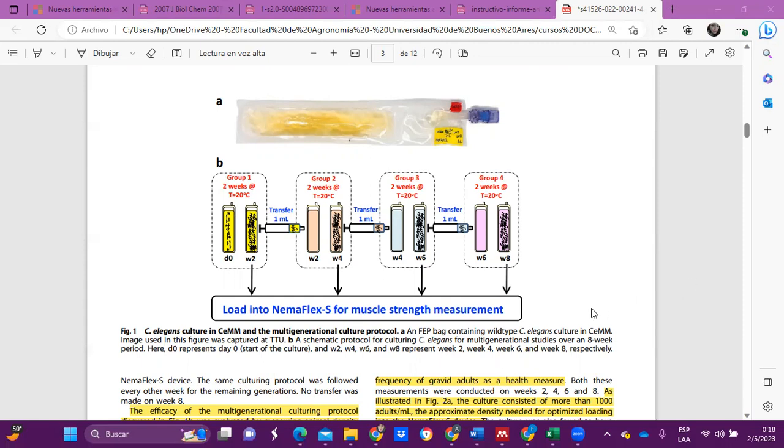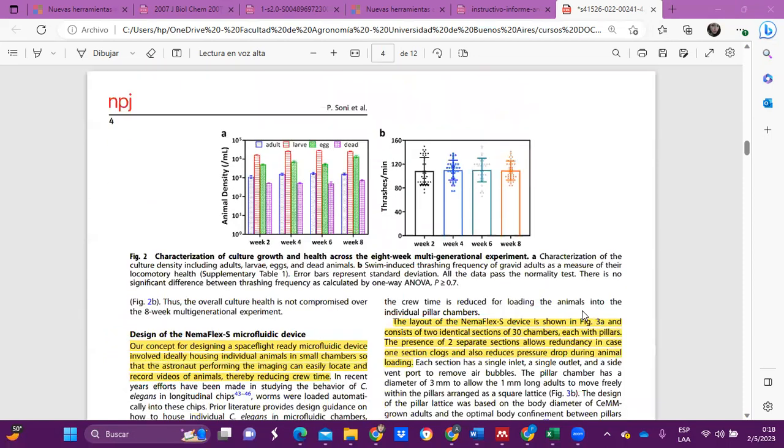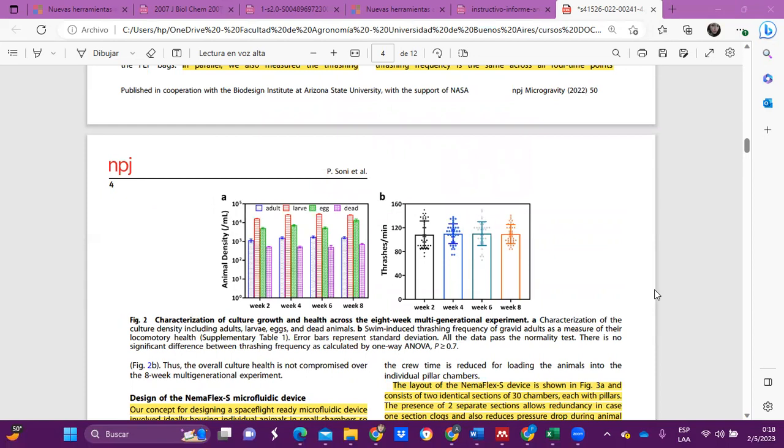In parallel, they also measured the thrashing frequency of gravid adults as a health measure. In this view, you can see the culture consists of more than 1,000 adults per milliliter, the approximate density needed for optimized loading within a NemaFlex device. The culture was also found to have several thousands of larvae and eggs, which shows good reproductive health and overall health of the animals in the culture. With regard to locomotory health, they found that the thrashing frequency is the same across all four time points. Thus, the overall culture health is not compromised over the eight weeks of generational experiments.